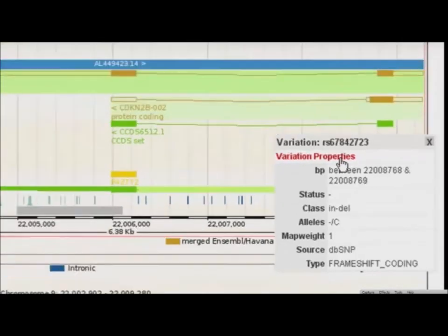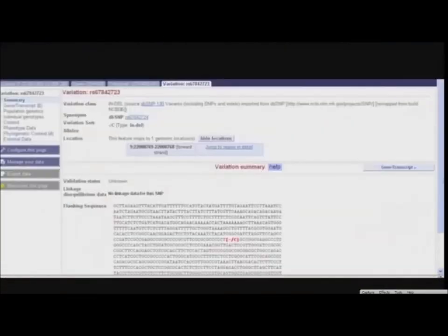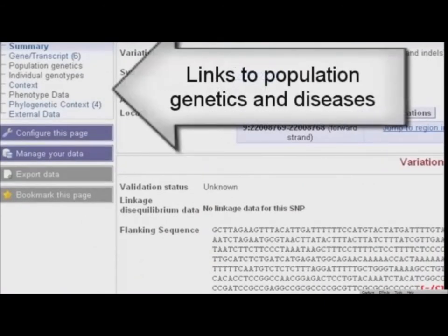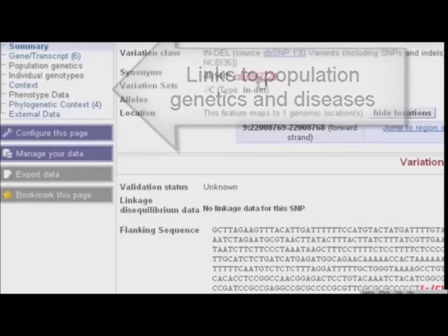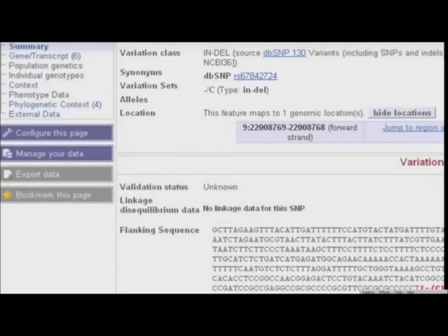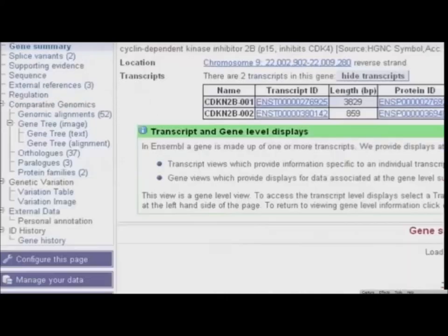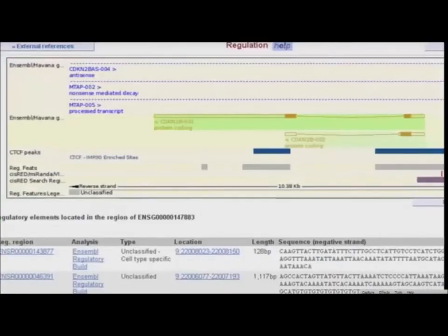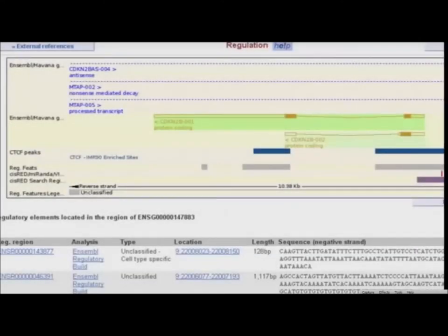Let's follow the link to Variation Properties. A fourth tab has now opened. Explore the links at the left to see more information about this variation, such as Population Studies or Disease Association. Or follow the link to NCBI-DB-SNP to view the original submission. The fifth tab in Ensembl is the Regulation tab. To find it, click the Gene tab and then Regulation. Here we have information from the regulatory build. These ENSR IDs represent sequences associated with open chromatin, based on DNase-1 hypersensitive sites and CTCF binding sites. Click on one to open the Regulation tab.